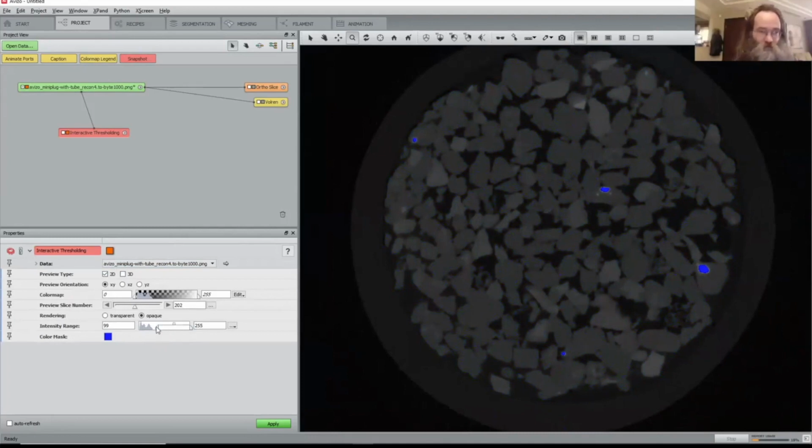So these high intensities seem to be beyond this first peak. The first peak seems to be the rocks. So let's select the first threshold just behind this peak. Let's make it something like 78.